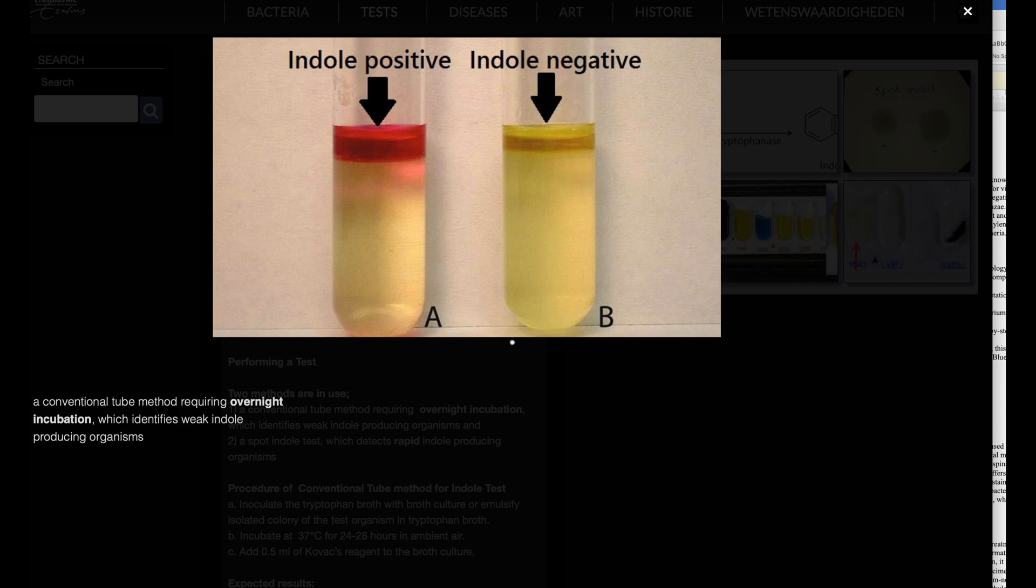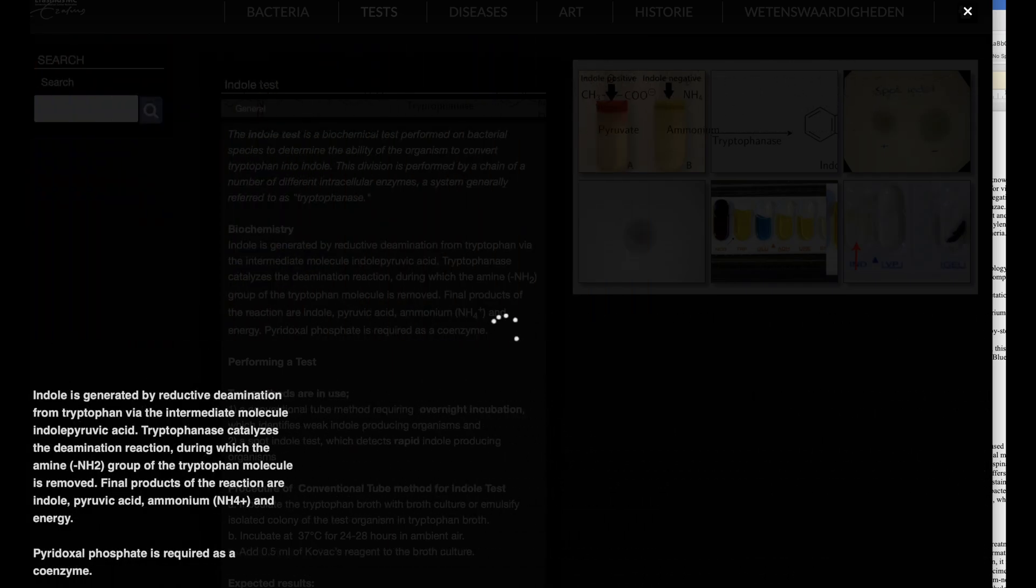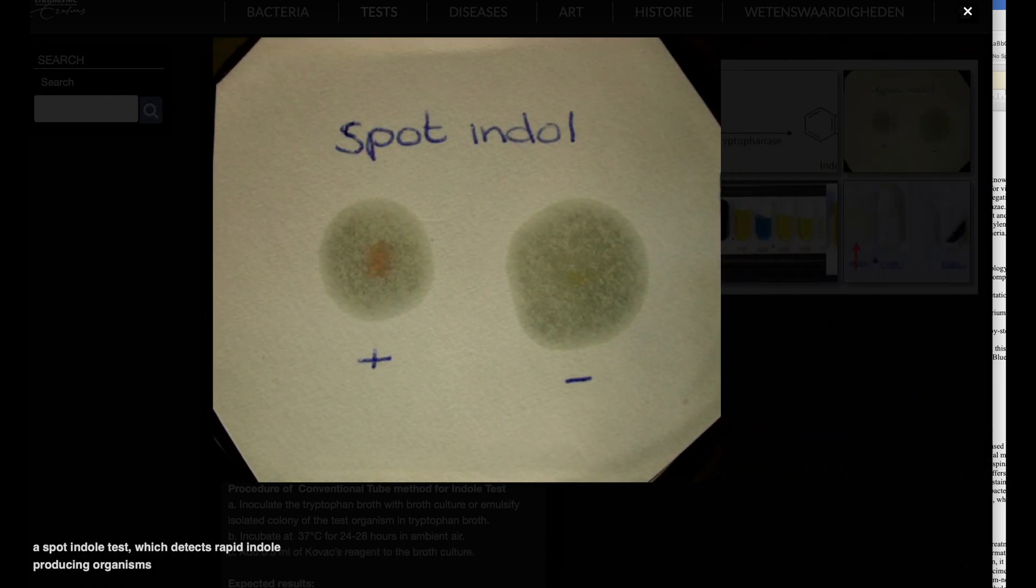Organisms that swarm on 5% sheep blood agar, have a characteristic odor, and are oxidase negative can be presumptively identified as Proteus species. Further testing with the spot indole test can help differentiate between Proteus vulgaris, indole positive, and Proteus mirabilis, indole negative.